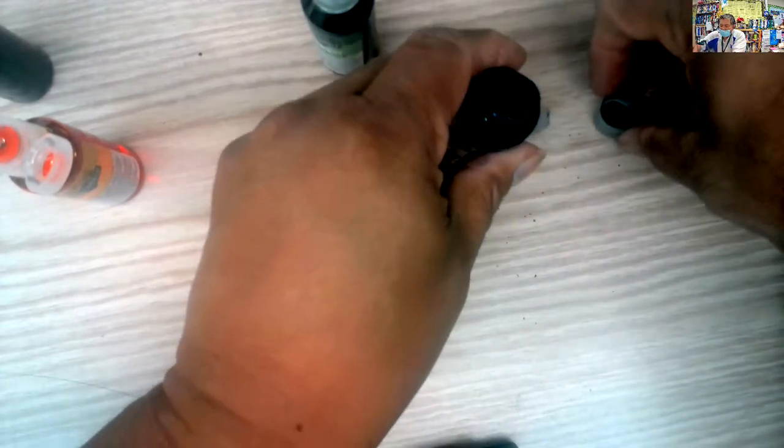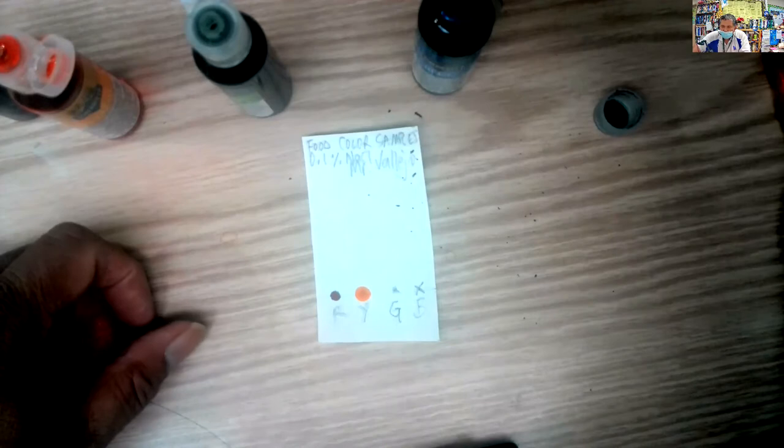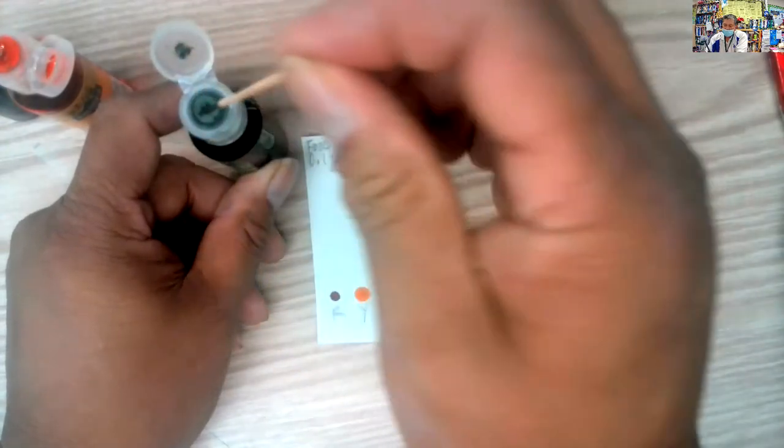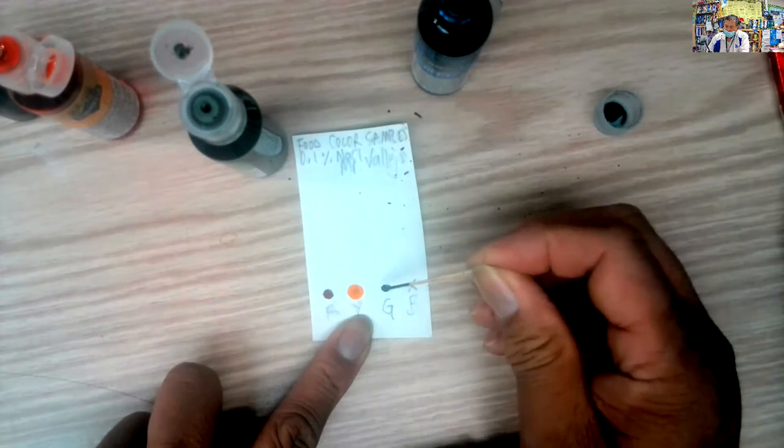The blue one doesn't have a nice tip like the other three bottles. Here's the green. I take the green and put it in, and I'm going to touch it to the paper.